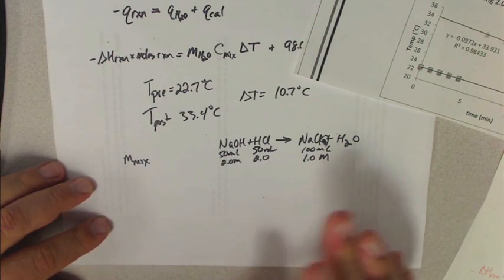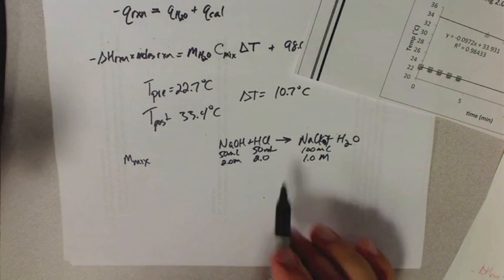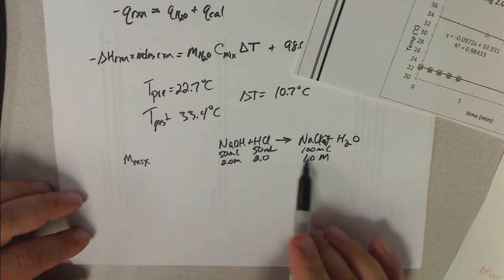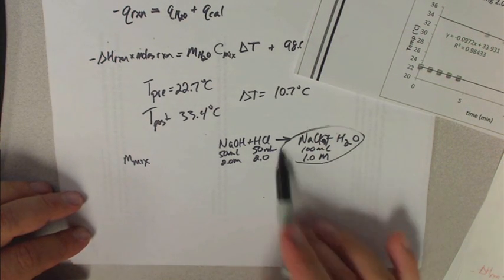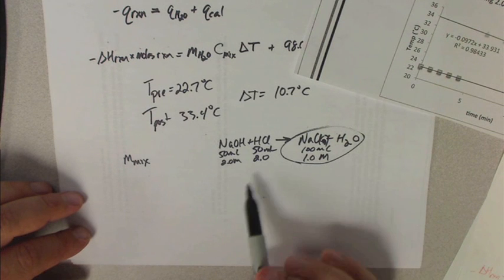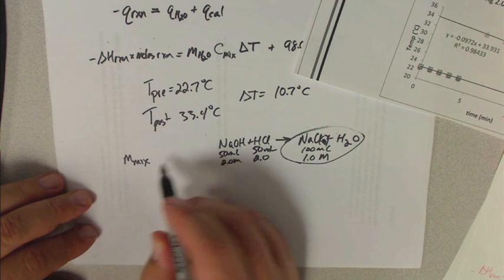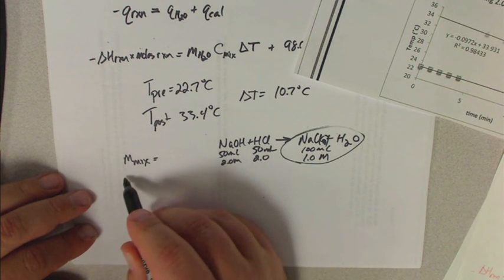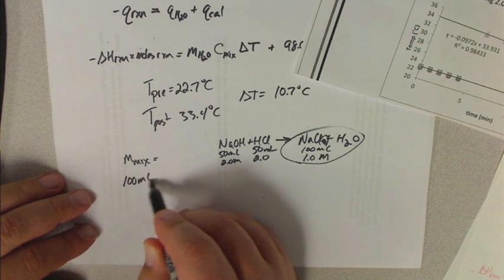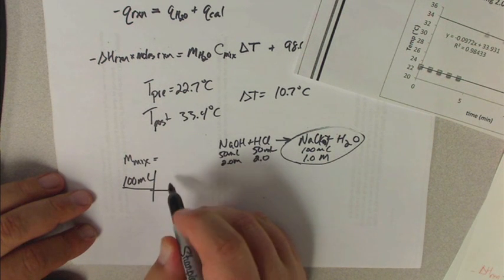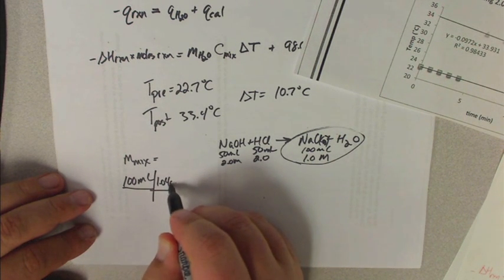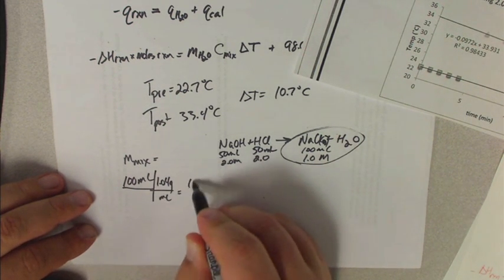So if you look in the tables, and of course, if you have something else, then it's going to be a different reaction. Maybe two hydrogens are being transferred. You can look up in the lab manual, and it has the density and the heat capacity of 1 molar sodium chloride. So in this case, the mass of the mix is going to be equal to 100 mils. And the density of this, if you look it up, is 1.04 grams per mil. So that ends up being 104 grams.